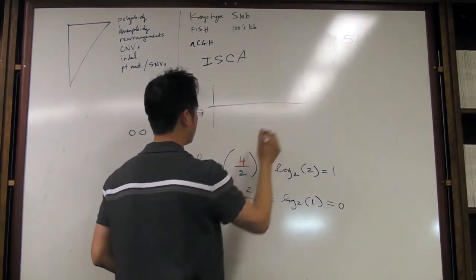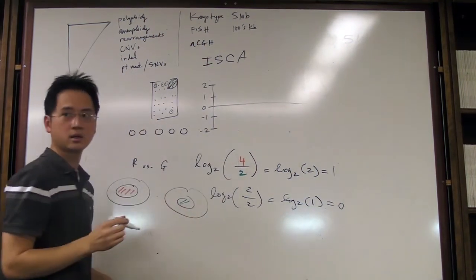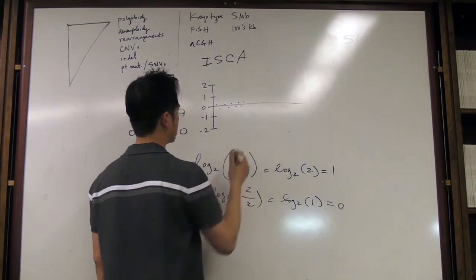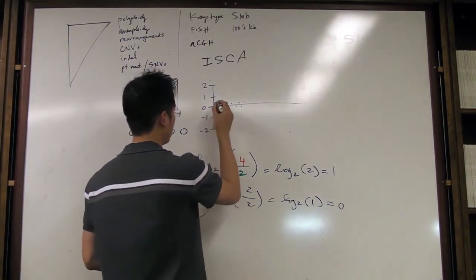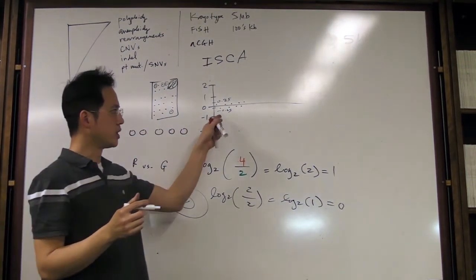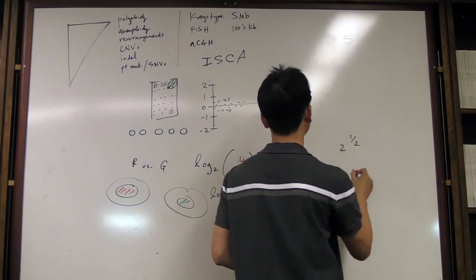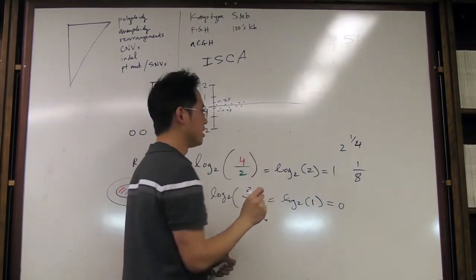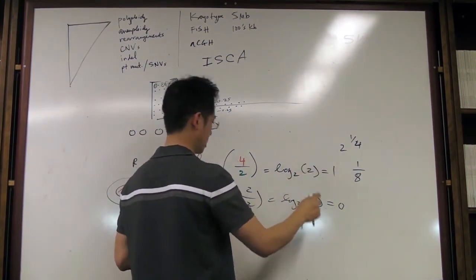So what I'm going to draw is a log base 2 ratio plot, like that. So for most cases, let's just say we go through, right, and we have 6 or 7 probes that all are not showing any difference between red and green. So what does not any difference mean? We usually have a threshold. It's at 0.25 or minus 0.25. So I forget what 2 to the 0.25 is. 2 to the 0.25 is 1/8. Is that right? So if there is a little bit more of something, 1/8, am I getting this right? That's the negative, sorry.